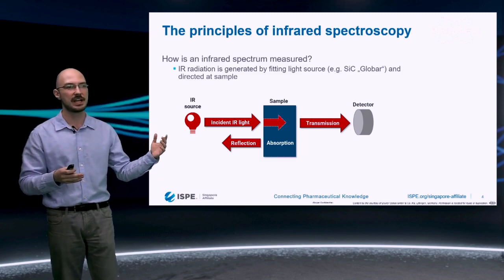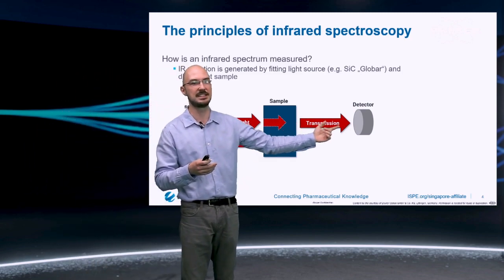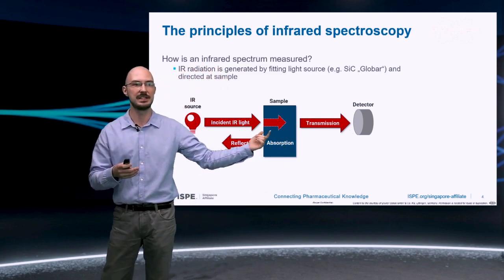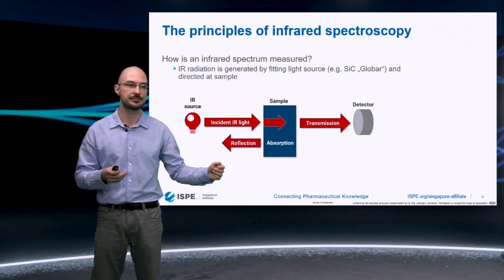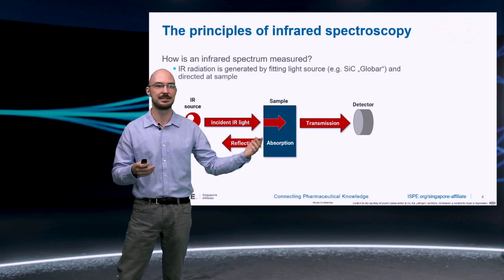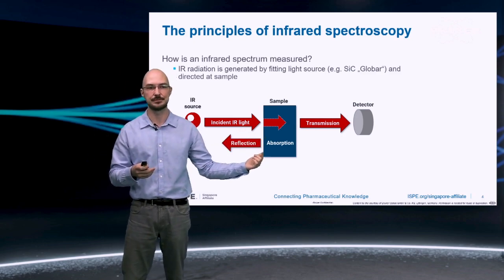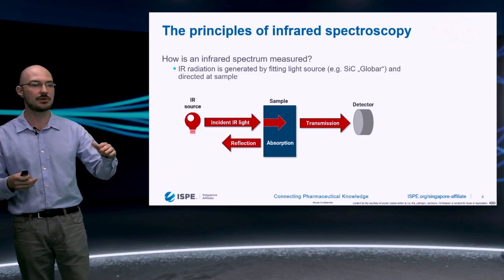And then we can go even further. We have transmission here, hitting then a detector. The transmission is the infrared light minus the light absorbed by the sample due to the bonds now vibrating. But obviously, that's simply like a mirror, we also have reflection here, meaning that we can put a detector in for transmission or reflection.